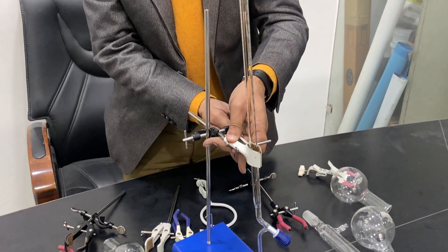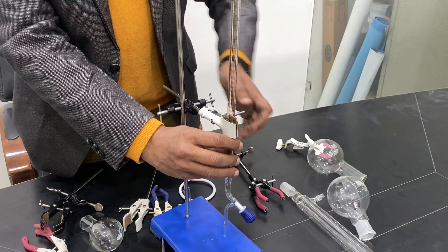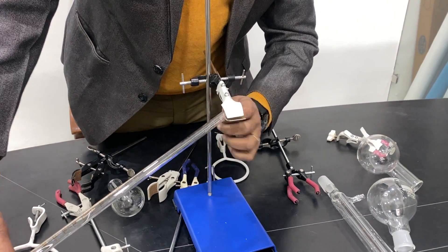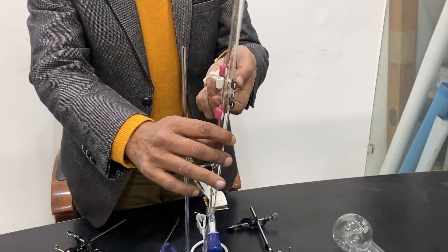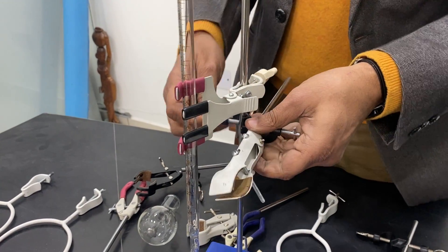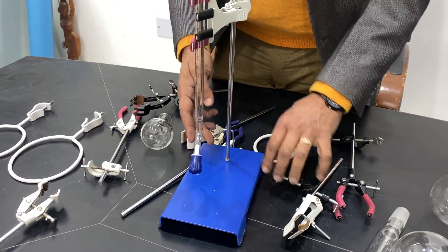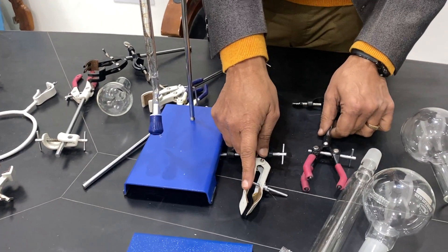Mostly in labs, people use this clamp for the burette, but there is a problem — the burette can move with this clamp. So it is better to avoid this clamp for holding the burette. The special burette clamp is a better option: there is no left-right movement; just hold it and push it inside. It is very easy — you can take out the other one and there is no movement when using it. It is stable. This is the base, rod, boss head, and the special burette clamp.